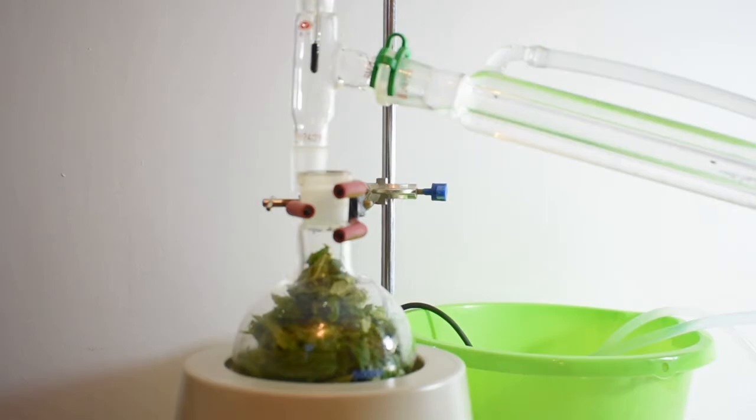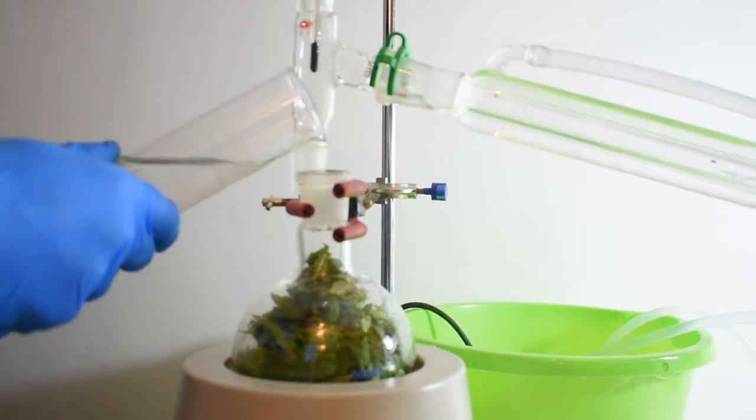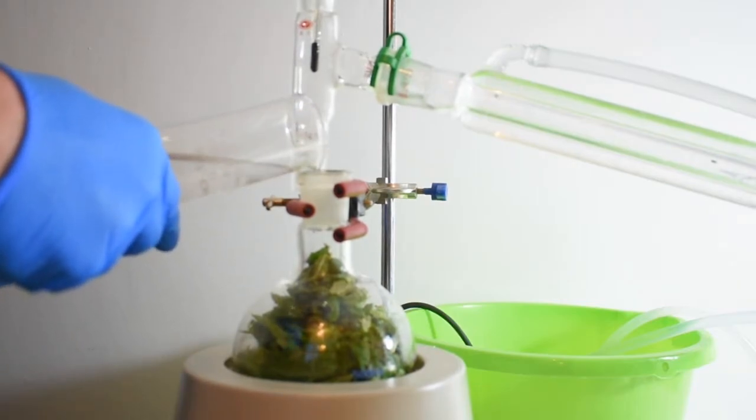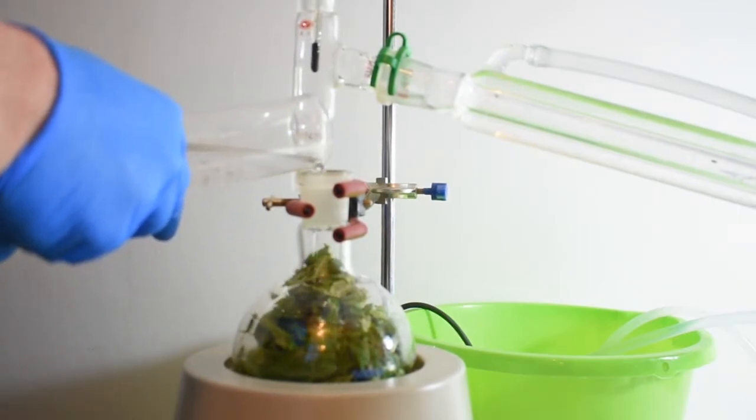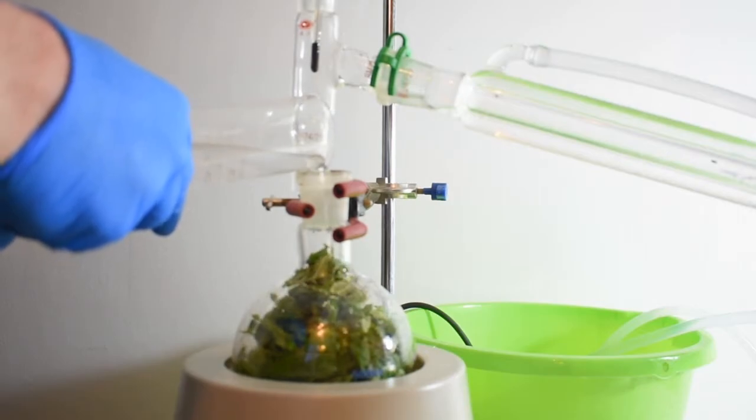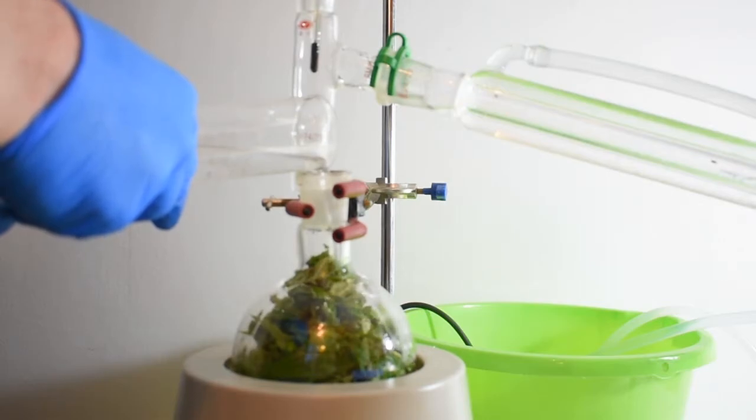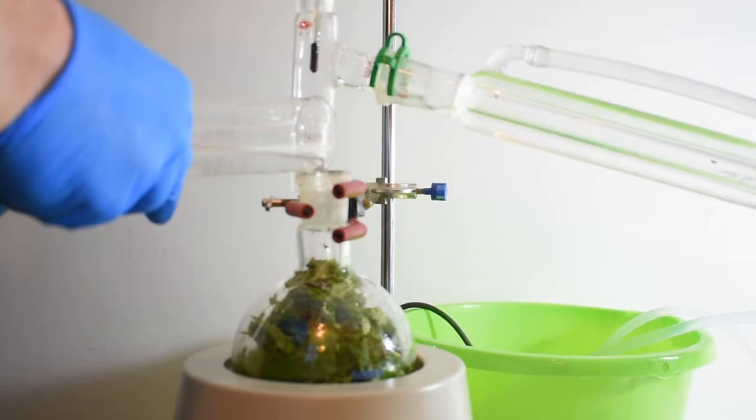After emptying the used mint out of the flask and refilling it with fresh mint, I'm adding another 250 milliliters of water, and then I'm going to turn on the heating again. Essentially, I'm just going to do this another four or five times until we have a lot of distillate with our menthol mint oil in.